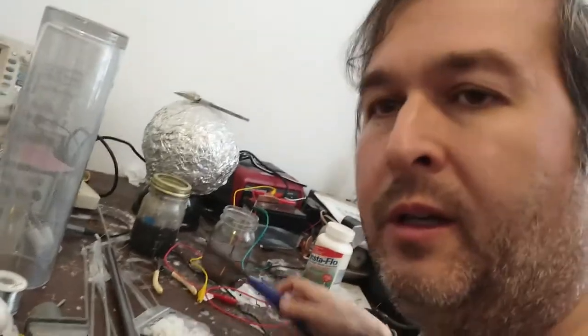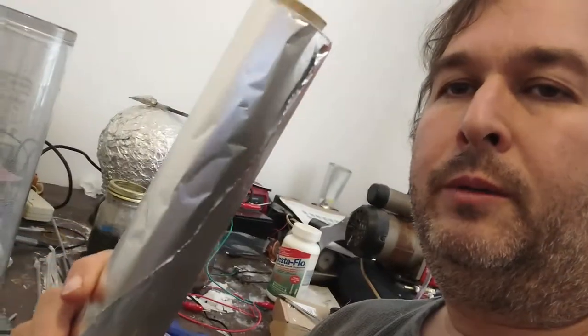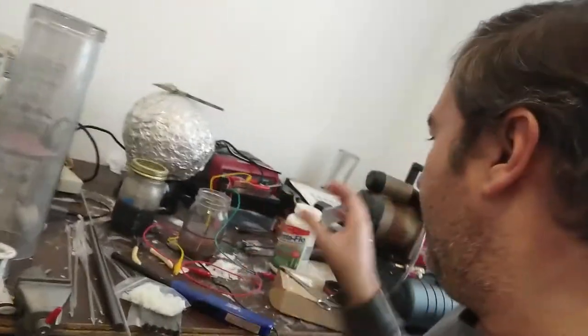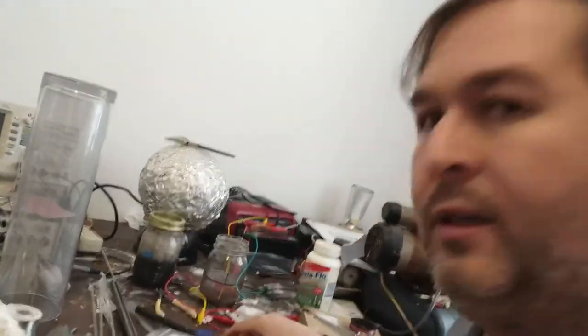Hello, this is Dr. Janes, and here's an interesting little heater you can use to heat things up. You have a mason jar and some aluminum foil and some sodium hydroxide. Okay, here we go.